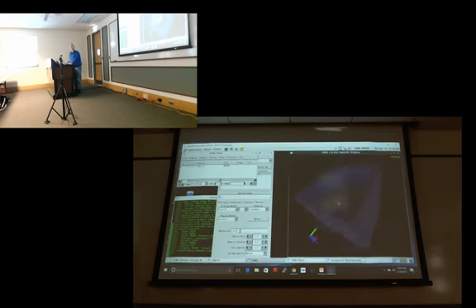GLSL does a much better job drawing transparent surfaces. So now I've shown you the solvent box. And this is like I was describing before. If you look straight into the surface, it's mostly transparent. But if I zoom out, if you look at the edges, they're then opaque. And so this is a great material property. This is this glass bubble. And so you can use this anytime you want to show some detail in an interior and you don't want it to be obscured.